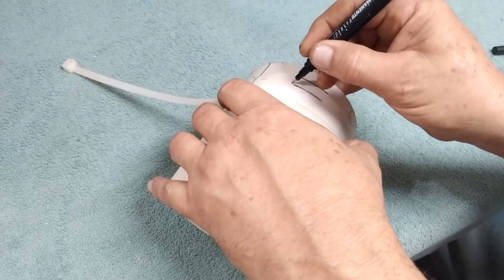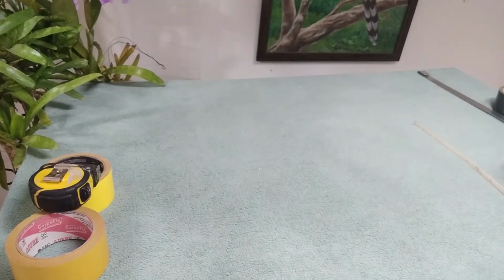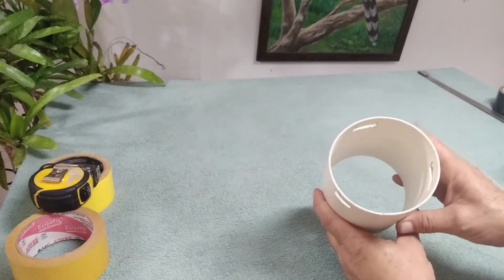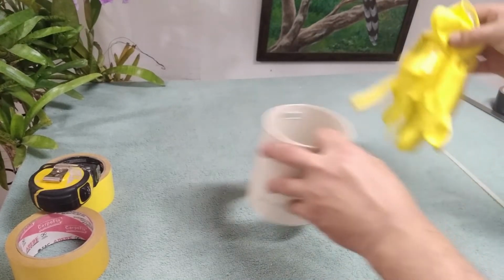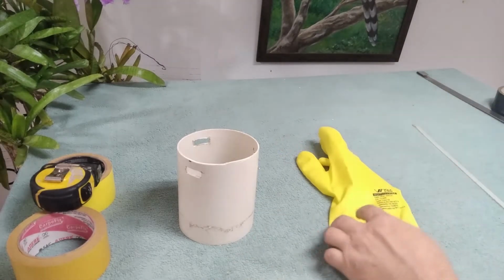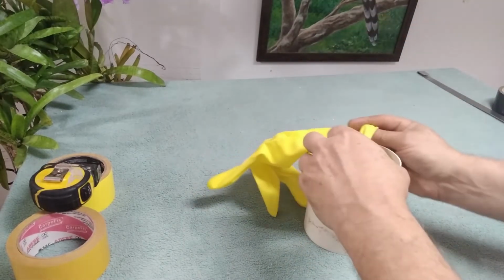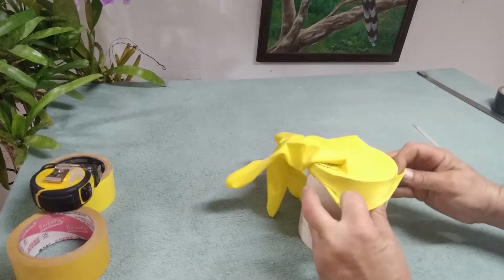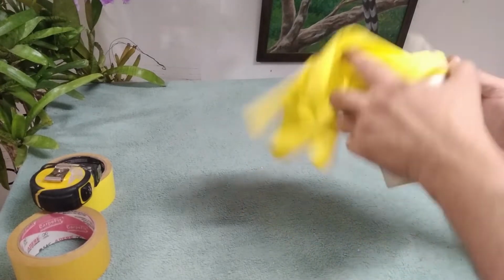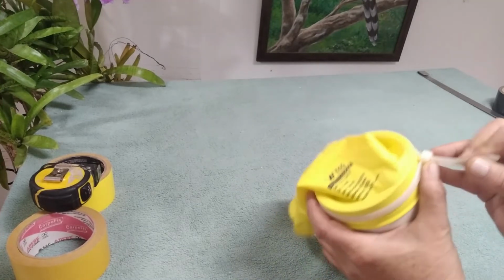Let's make 3 little marks here, close to the rim, like 1 inch long and as wide as your cable tie is. Now use a hot knife to cut open the 3 little slits. I'm right-handed, so I'm using the right hand of these regular gardening rubber gloves. But you must get the largest size you can find, super extra large. Fit the sleeve of the glove to the end of the pipe and hold it in place with one of your ties. Make sure it is docked into the slits we cut before and tie it really firm.